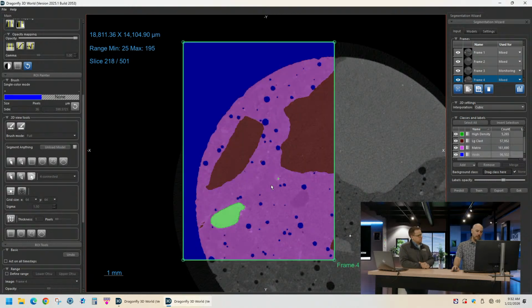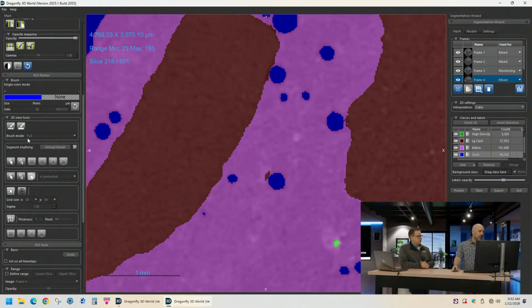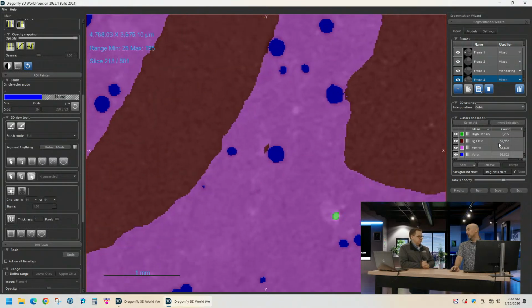And you can see here, I would say it didn't do this correctly. So we've got to fix something. One thing I love: we can choose brush mode, so we can see. Billy's favorite features.